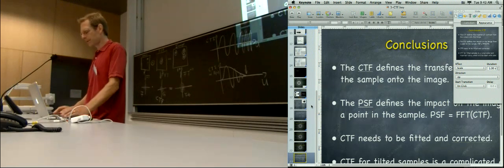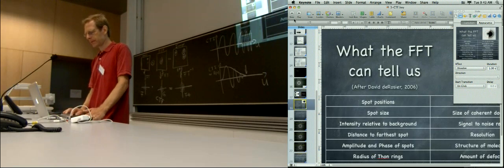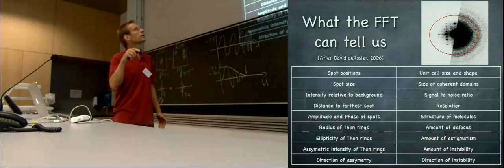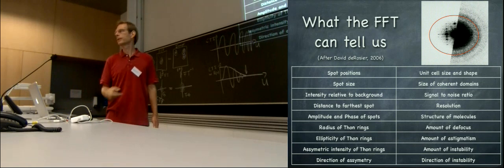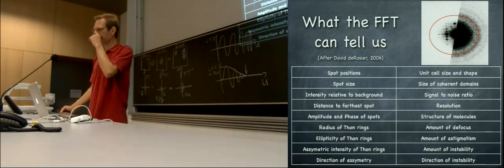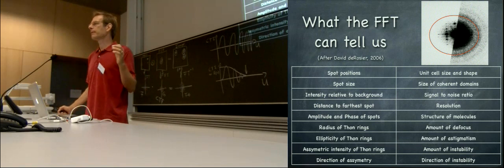One way would be to just go and say what is the signal to noise ratio. So how strong are my spots, or all spots summed up, compared to all the pixels that are outside of the spots? That would be a measure for the signal to noise ratio. And I think in 2DX we even have somewhere a point where it calculates that.